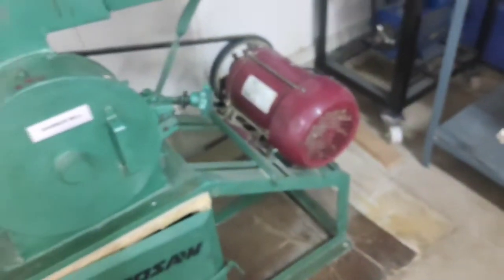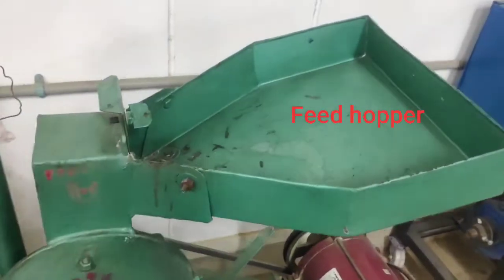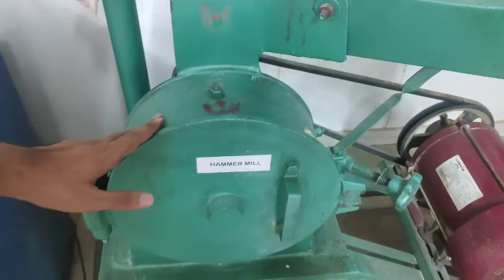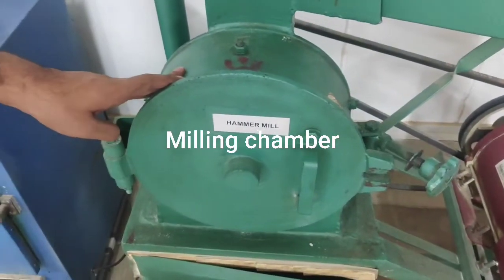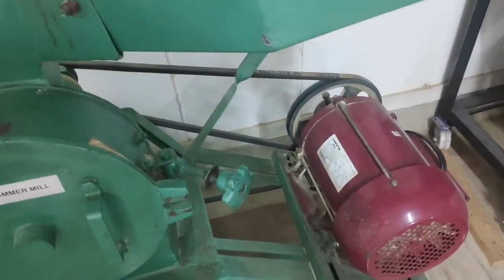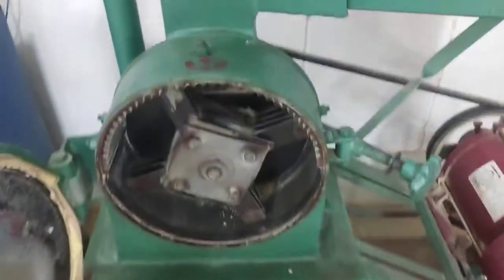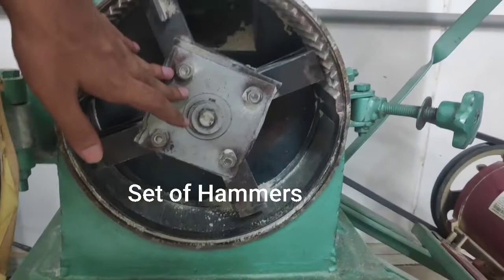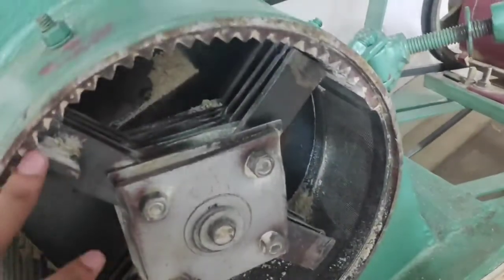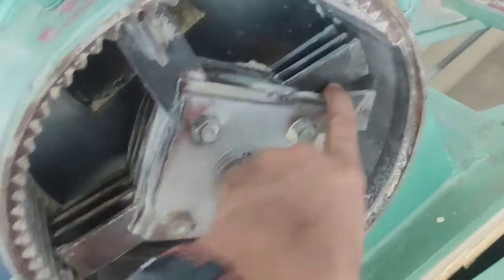The components of the machine are a feed hopper, a feed control valve, a milling chamber or grinding chamber, and a motor attached with a pulley and a V-belt to the shaft. The shaft is connected to a set of hammers. In total there are 16 hammers — each hammer arm consists of 4 hammers, so 4 into 4 equals 16 hammers.